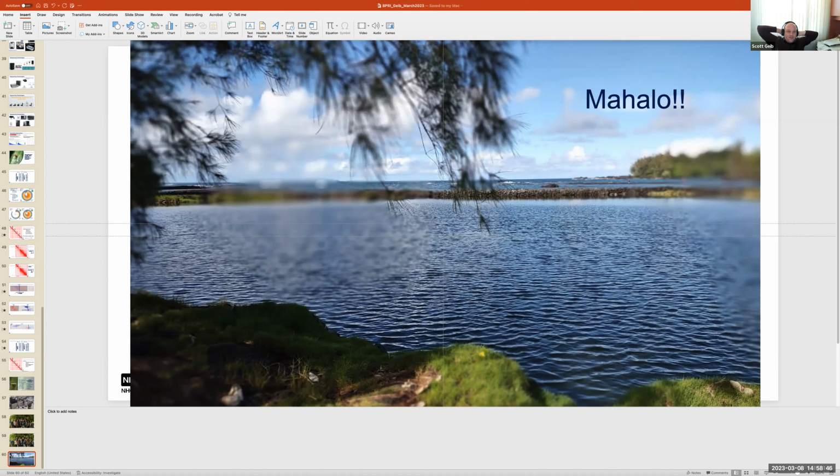But I would just go back to your short read sequencing for those types of things if you're just looking for markers. Long read sequencing sounds good, but if you're not looking for structural changes, if you're not looking at phasing, you don't really need it. You could even do a reduced representation library if you just want to say, what is the population structure? What does a DAPC type of analysis look like for these populations?